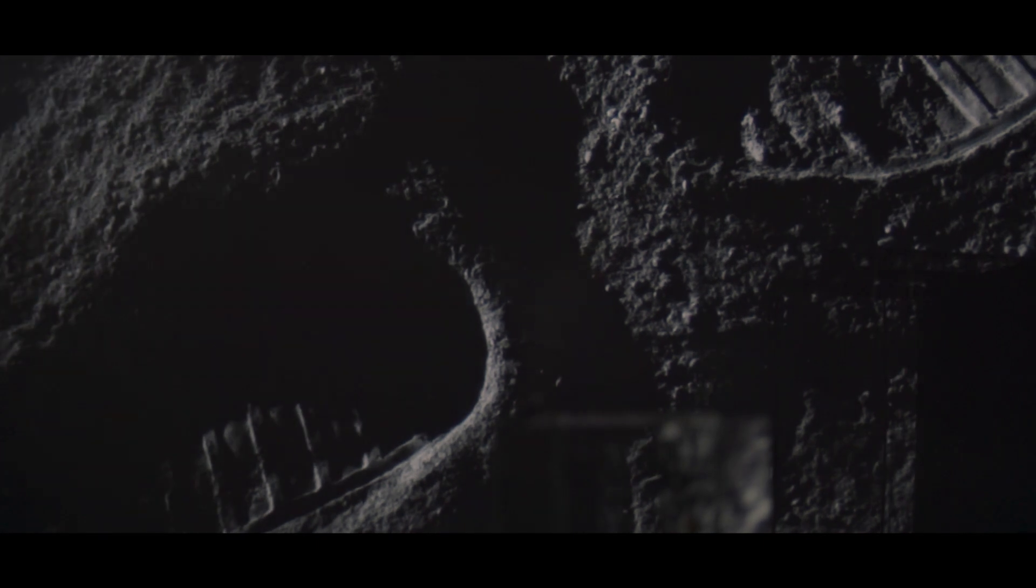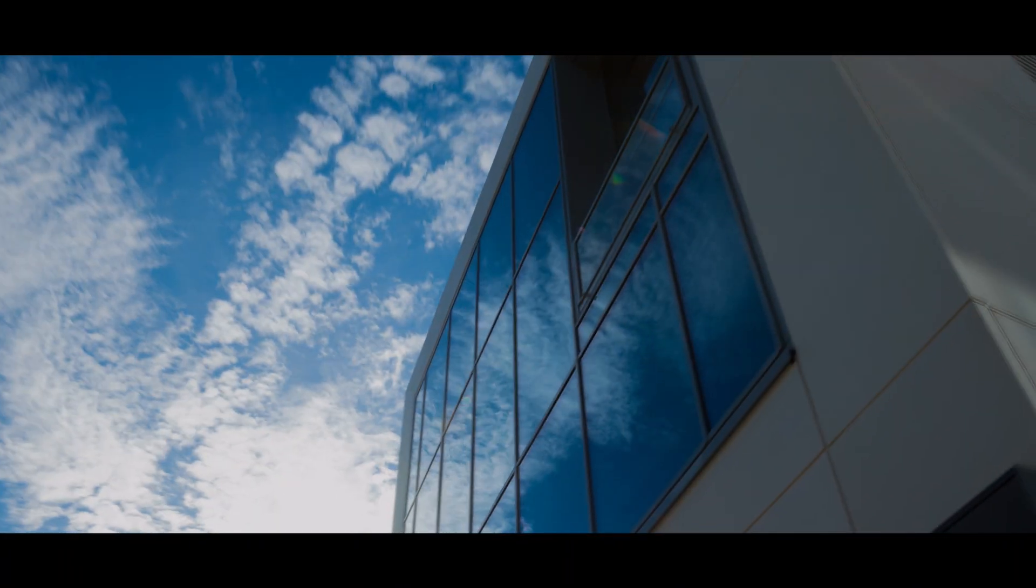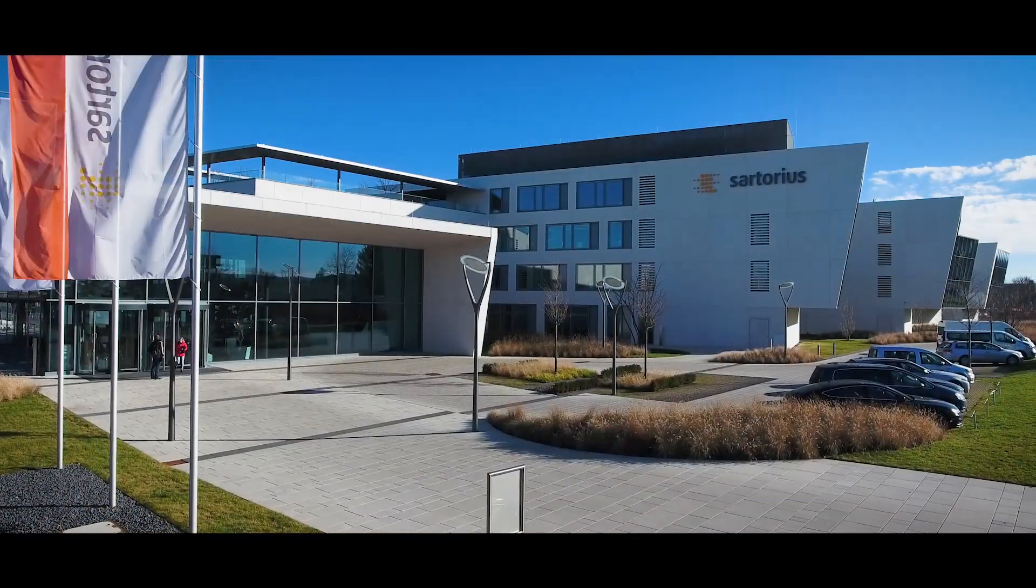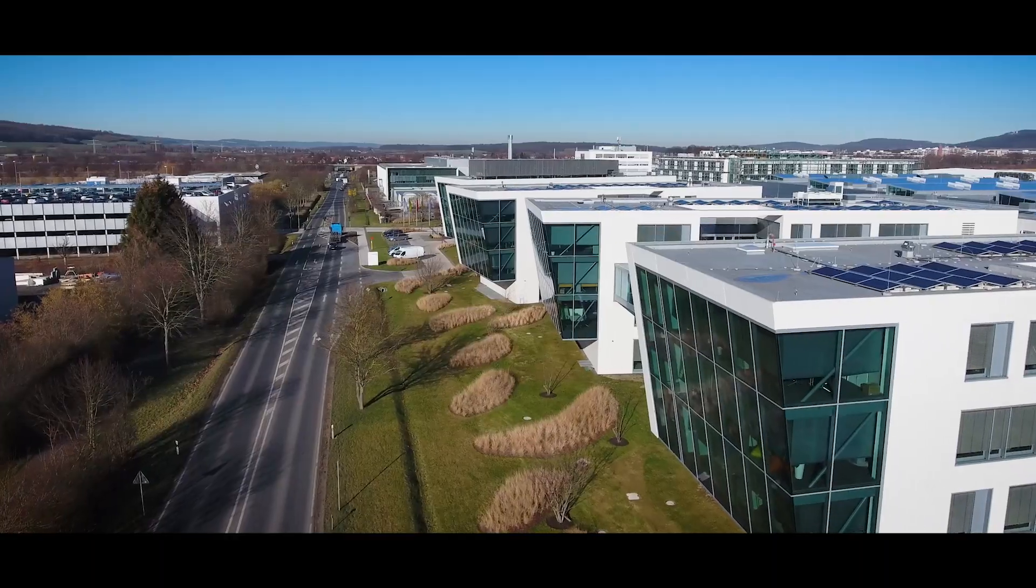To weigh this 20.2 milligram sample, one of the most precise weighing instruments built at that time was used. An analytical balance by Sartorius.